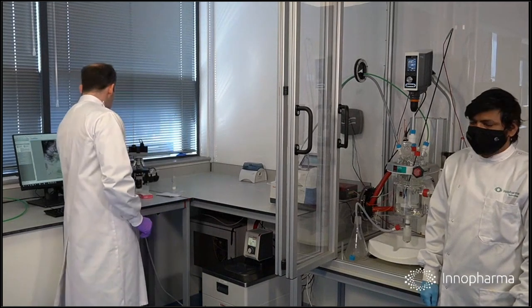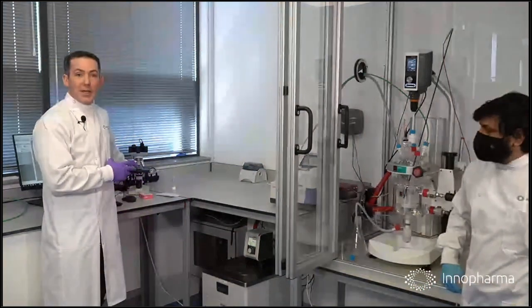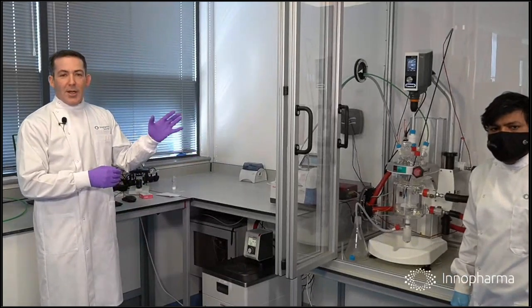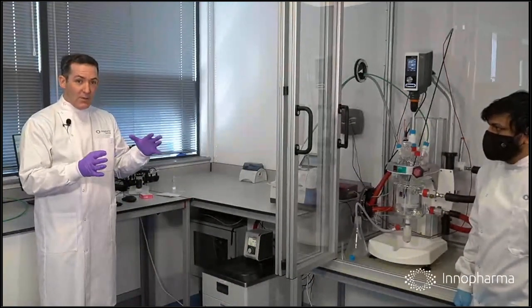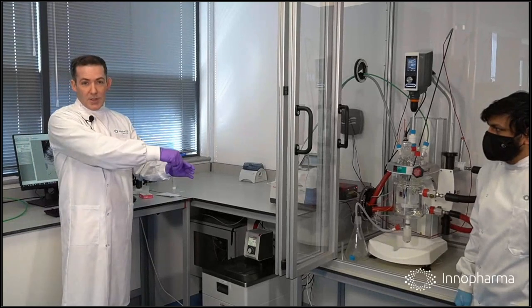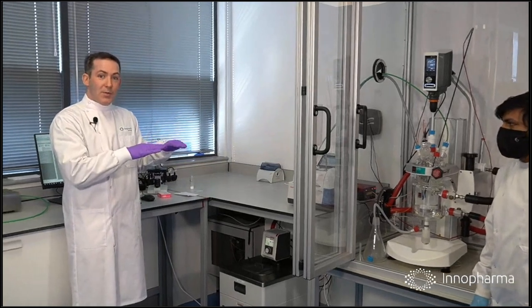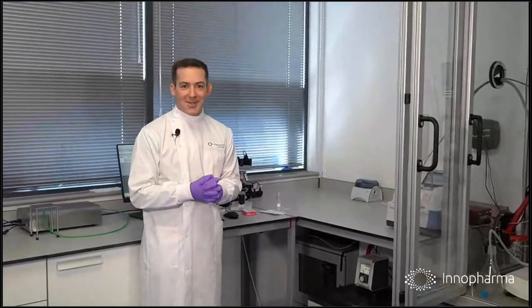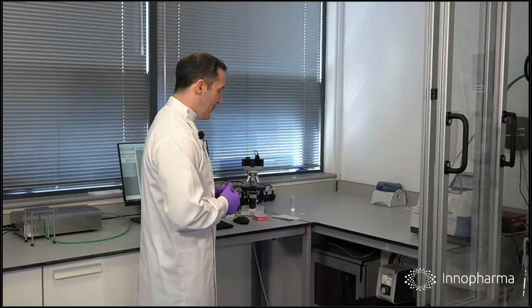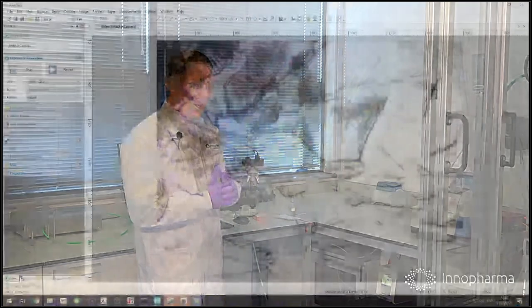What we have here under the microscope is a sample that's been extracted from the process while it was at 50 degrees and just dropped onto a slide. Even that process involves an operator extracting a sample, depositing it on a glass slide, and waiting for the solution to evaporate so that we can then view it under the microscope. That's a laborious process, and yes, there are easier methods. That's what people had to do and what people still do in analytical labs. I'm going to switch to the screen now to show you what those crystals look like.